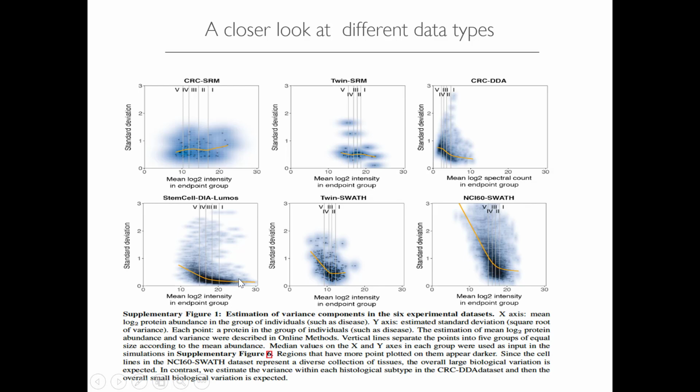You see here the dynamic range, these are log2 levels of protein abundance measured by the signal intensities. It spans a wide range, and it also does not really go up that much like the older instruments, although we also have to say that in this data set it includes not just technical variability, but also a lot of biological variability because different cell types were analyzed.